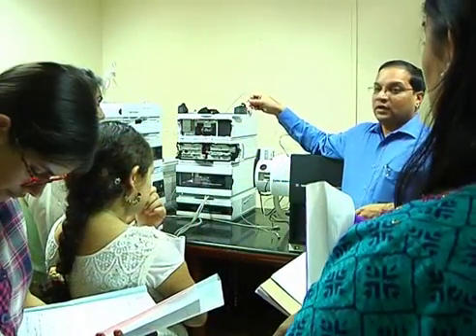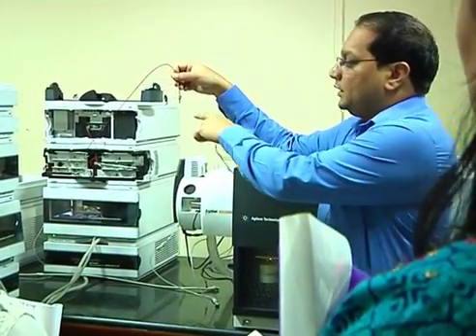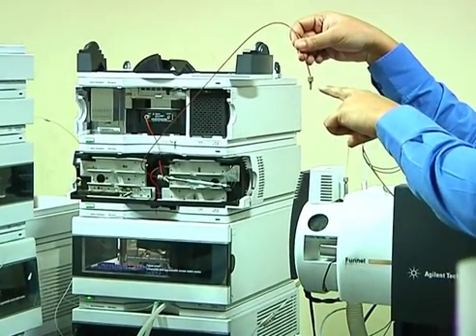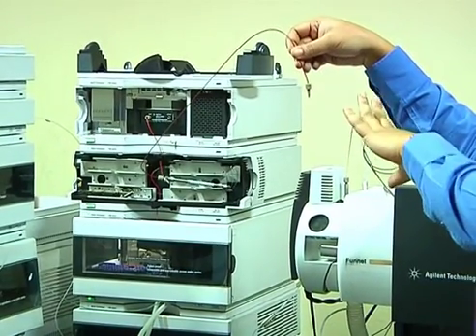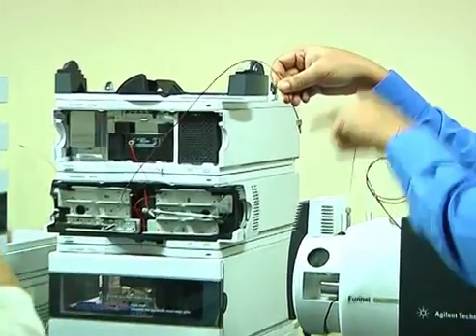Right now, at the initial stage when I have to load the sample, there is a flow going on which is 3% organic and 97% aqueous. So it is mostly water right now because I have to inject the sample.